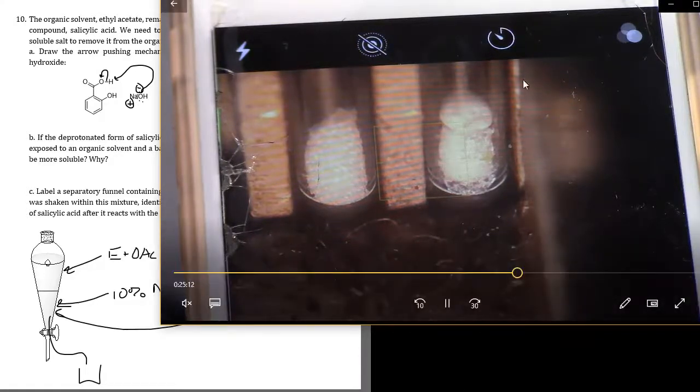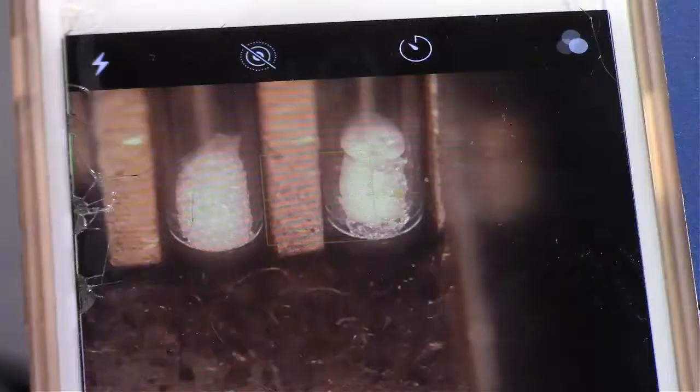So the caffeine sample that we isolated from the experiment is on our right. The pure caffeine is on our left, and you can see significant difference even just looking at these two. Like I said again, there is filter paper in this caffeine here. There is not any paper in this. This is the pure caffeine, our melting point standard. We've zoomed in here to get a close-up view of the two samples. So we just need to watch and see when they are going to start to melt.